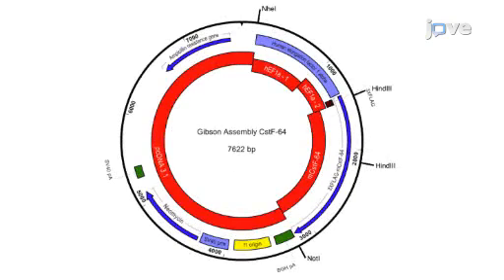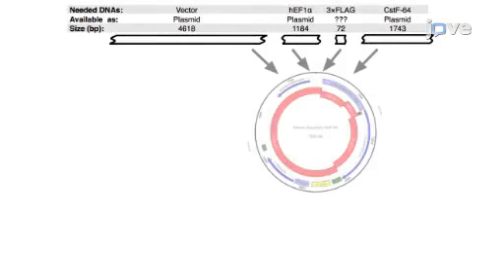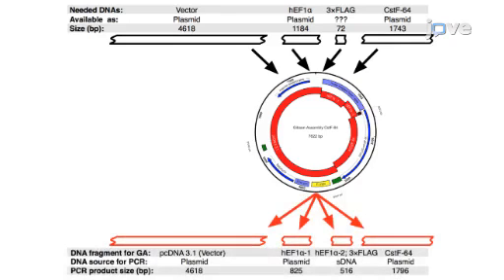Ultimately, the Gibson assembly reaction is used to develop in parallel plasmids that contain flag-tagged versions of the wild-type and mutant CSTF64 proteins under the transcriptional regulation of the human elongation factor 1-alpha promoter. The main advantage of this technique over existing methods like traditional DNA cloning is that it can create in parallel similar in design wild-type and mutant plasmids without sequential cloning steps.